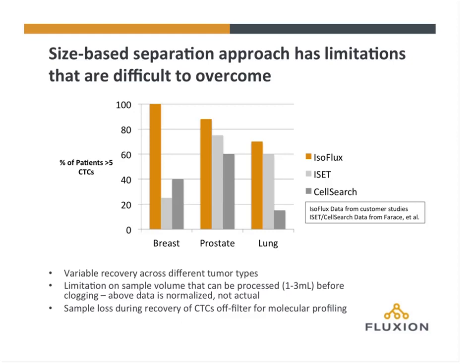And additionally, once the cells are collected on the filter, there's a real risk in losing CTCs in the transfer step between the filter and recovery for molecular work. And several papers have mentioned this transfer loss.